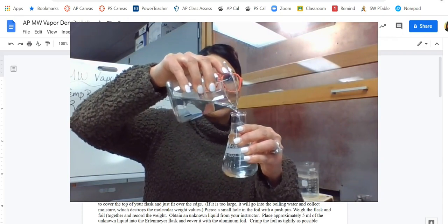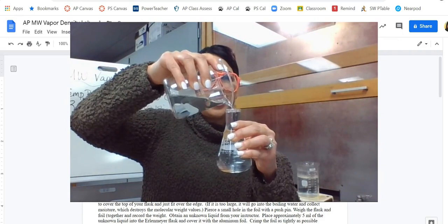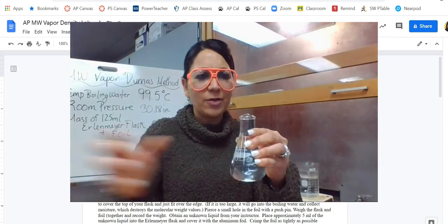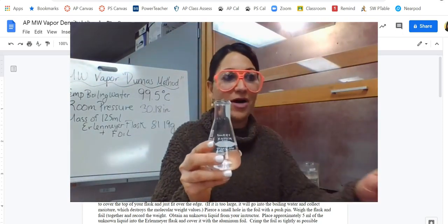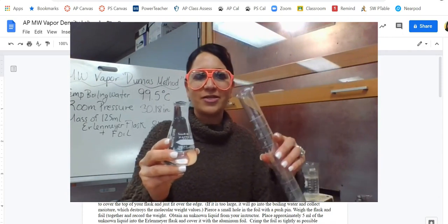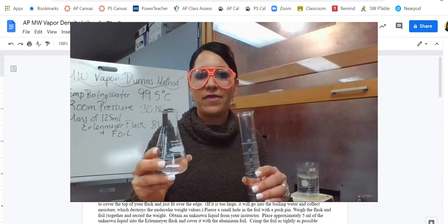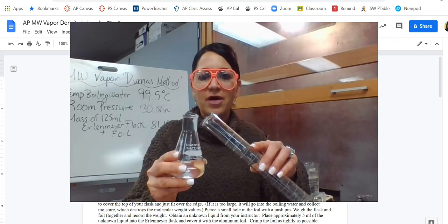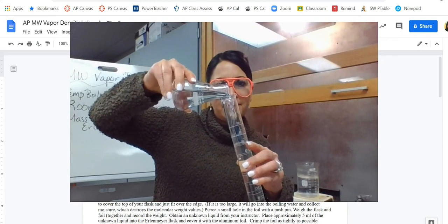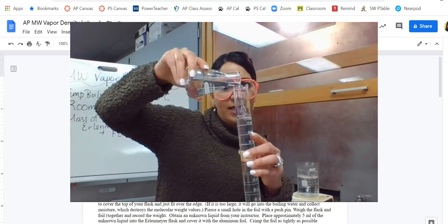So let's fill it right up to the top with water here. Let's see if I can do this without spilling. So I'm going to get it right up to the top as if like the foil was on there. So there's a little bit of air, but that's okay. So I'm like kind of a bum, so if I spill a little bit, it's all right. So I've got a 100 mil graduated cylinder here. So let's start now. I know it's going to be more than that. So let's start with the 100 mil. So I'm going to pour it right in here. Oh, good. I didn't really spill. Okay, so I'm going to get it right up to that meniscus, right up to that line. There we go.